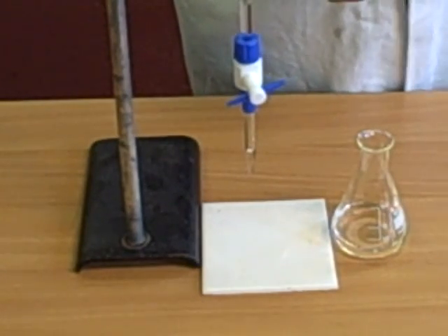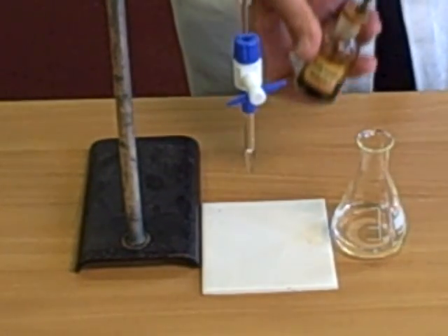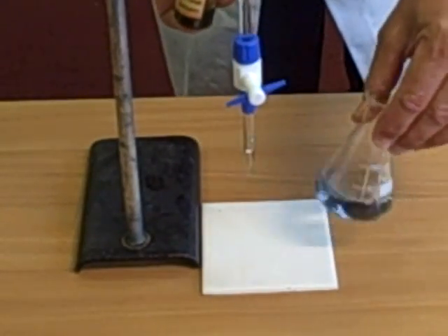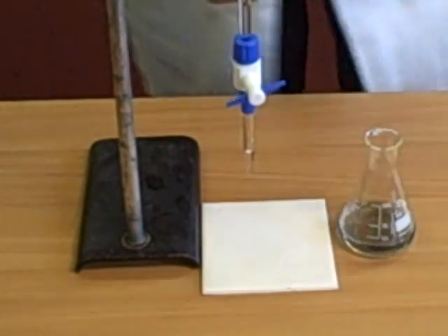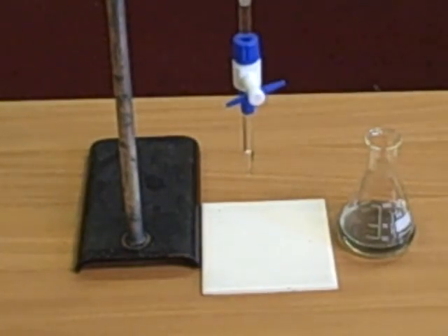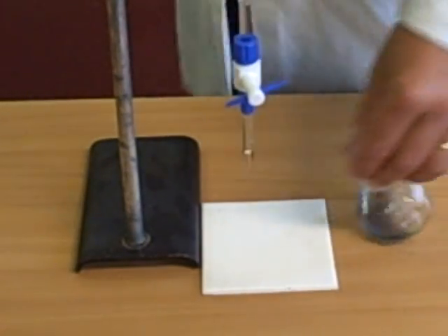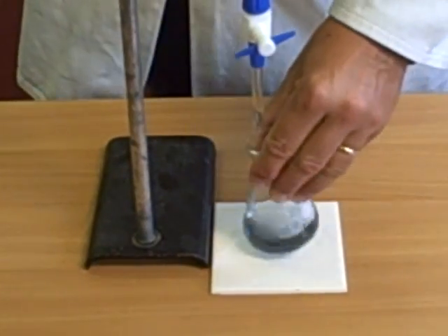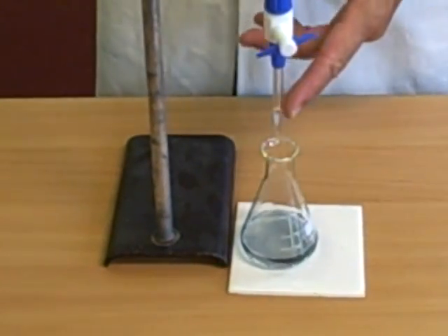But first, so we can see what is happening in here, I'm going to add some indicator. Now, this is a universal indicator. I add three or four drops of that, and I get a nice blue colour. Different indicators give different colours. Now, what I do is, we'll lift this to a proper height.